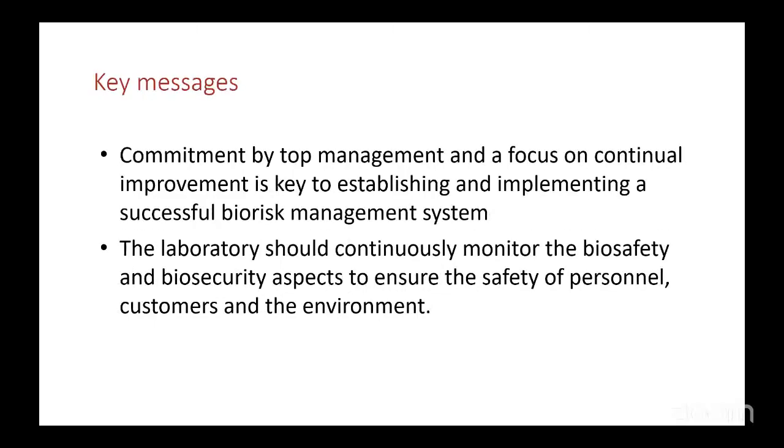Commitment by top management and a focus on continual improvement is key to establishing and implementing a successful biorisk management system. Laboratories should continuously monitor the biosafety and biosecurity aspects to ensure that the safety of personnel, clients, customers, and the environment is taken into consideration.